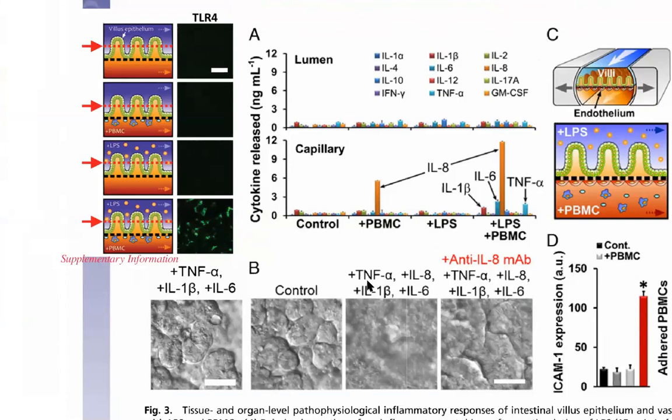They collected the epithelial cells and the PBMC to see their transcriptome level of the inflammatory genes. And the result is that there are 36 inflammatory genes that were actually upregulated in the epithelial cells, but there's no change in the PBMC.